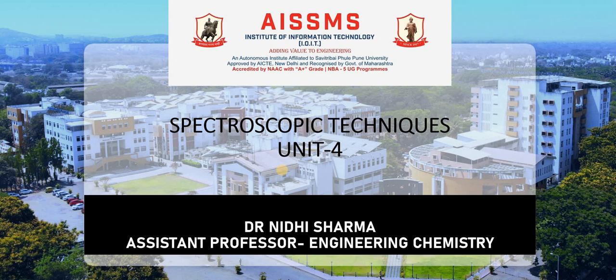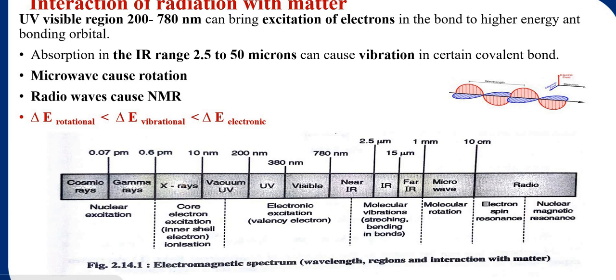My today's topic is spectroscopic techniques. In spectroscopic techniques, I am going to discuss the working of the UV Visible Spectrophotometer. So before we study the UV Visible Spectrophotometer, let's see how it is going to work.